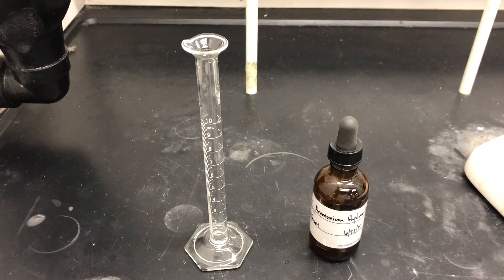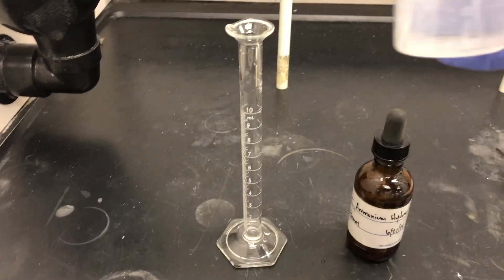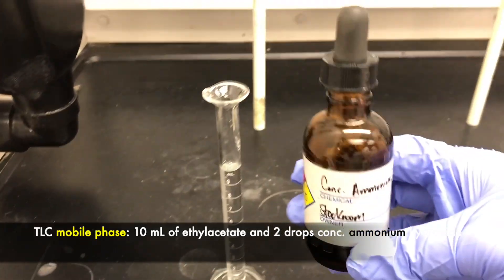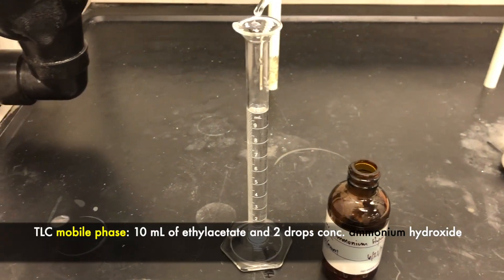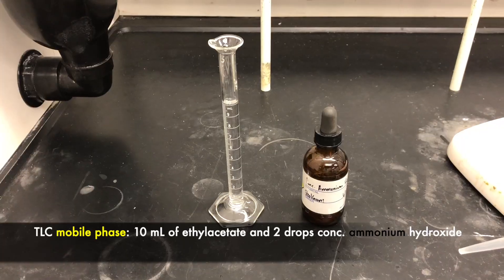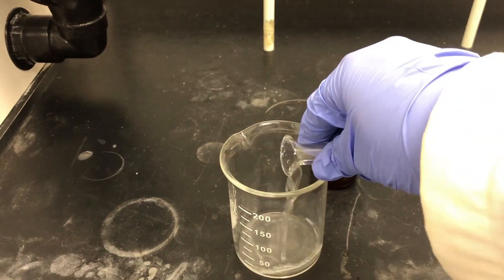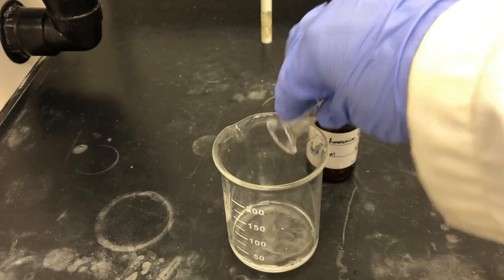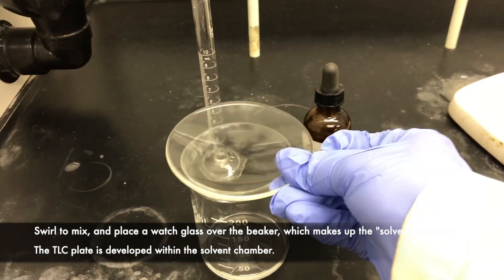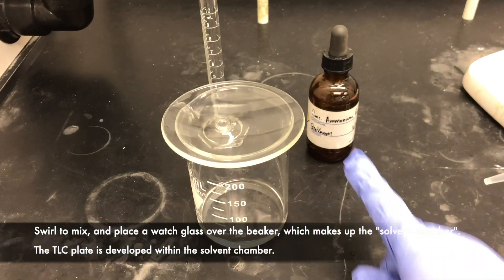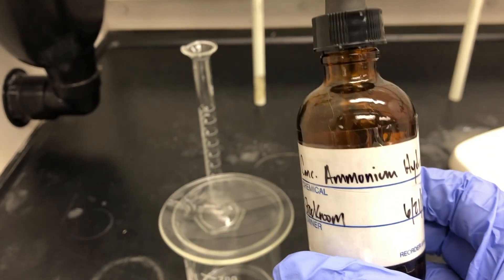For our TLC, the solvent we're going to use is ethyl acetate with two drops of concentrated ammonium hydroxide in a dropper. One, two. Then we'll place the solvent in a beaker, swirl it to mix, and place the glass lid on top. Notice this is a concentrated solution of ammonium hydroxide, so you would need to take care not to breathe it in.